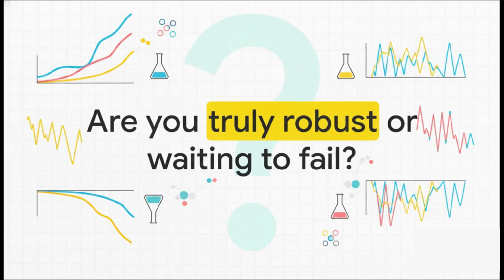So I want to leave you with this. Take a hard look at your lab's current methods. Ask yourself right now, are your assays truly robust? Are they scientifically defined by tools like DOE? Or are you honestly just waiting for the next reagent lot to fail, derailing your lab and halting your validation?